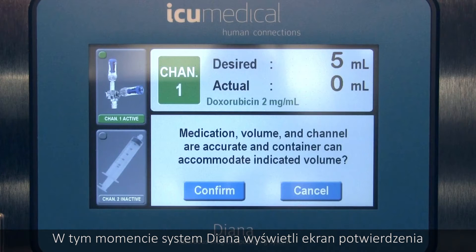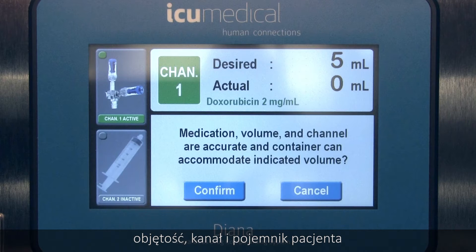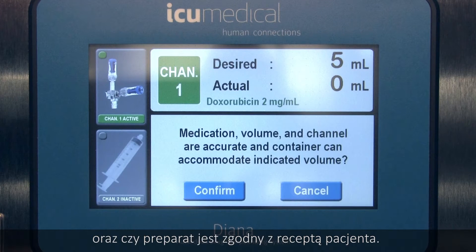At this point, the Diana system will display a confirmation screen asking you to verify that the correct medication, volume, channel, and patient container are being used and that the preparation matches the patient order.